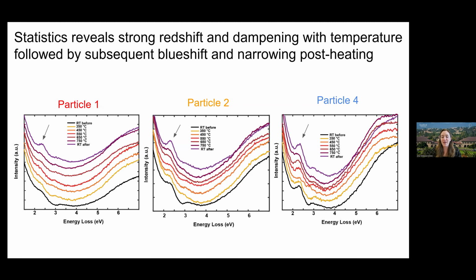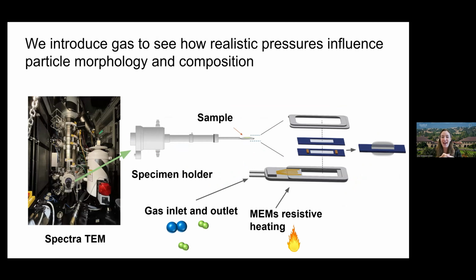So this is exciting. If we want to do photocatalysis, we really want it to be able to couple well to light. So our next question, basically we see this for a lot of different particles. Our next question was, how does gas change these morphological and optical responses?